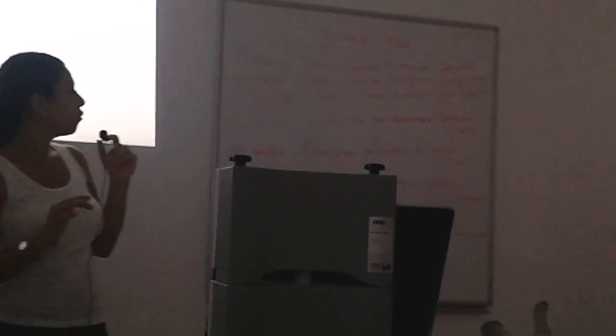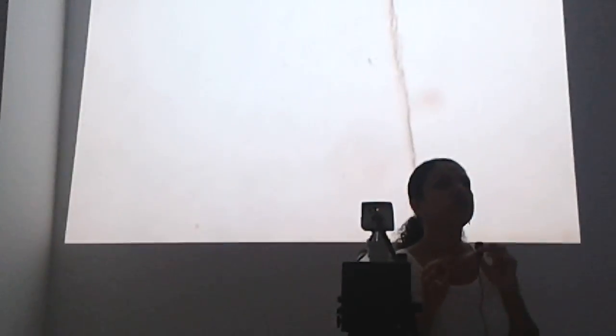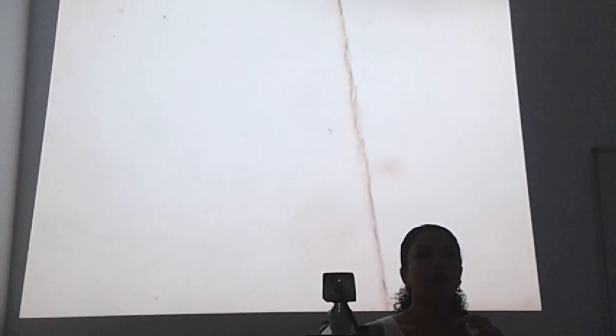The other example I'm going to show you is pseudo-stratified epithelium. Pseudo-stratified means yalancı çok katlı. Why do we call it pseudo-stratified? I'm going to explain. I can give the trachea as an example of pseudo-stratified epithelium.